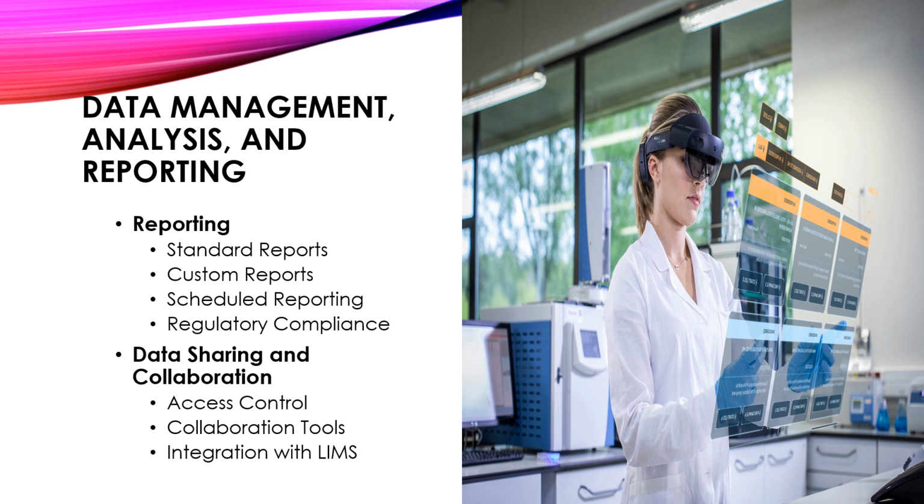Collaboration tools involves the use of LMS, including collaboration features such as messaging features, commenting features, and shared workspaces to facilitate communication and collaboration among laboratory personnel. Integration with a laboratory information management system. Now, laboratory management systems can integrate with laboratory information management systems, LIMS, to streamline data exchange and collaboration between different laboratory functions.